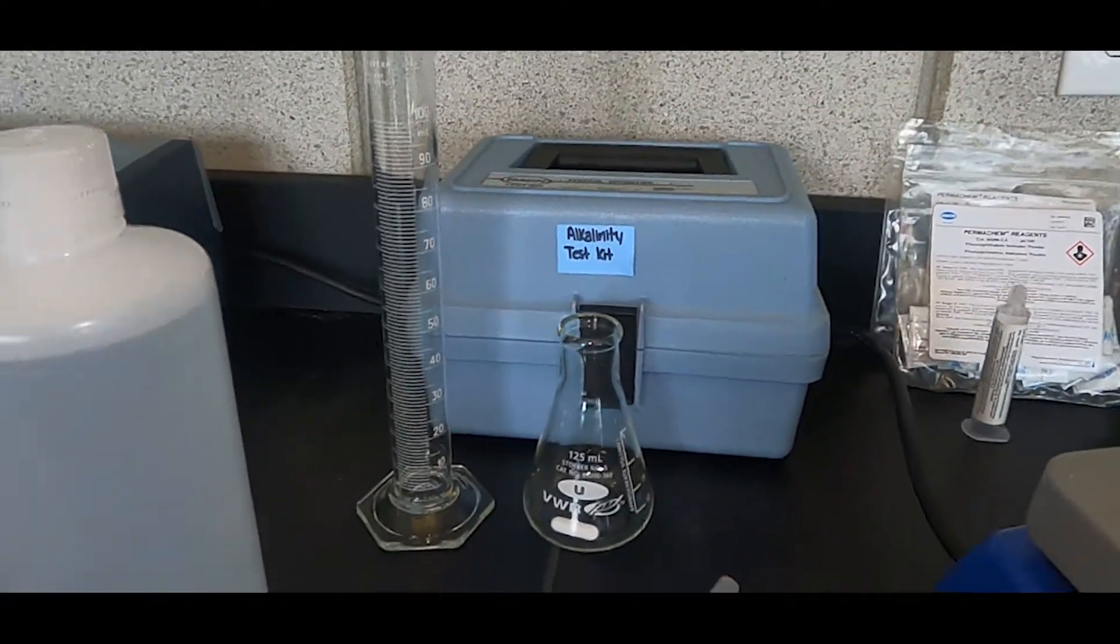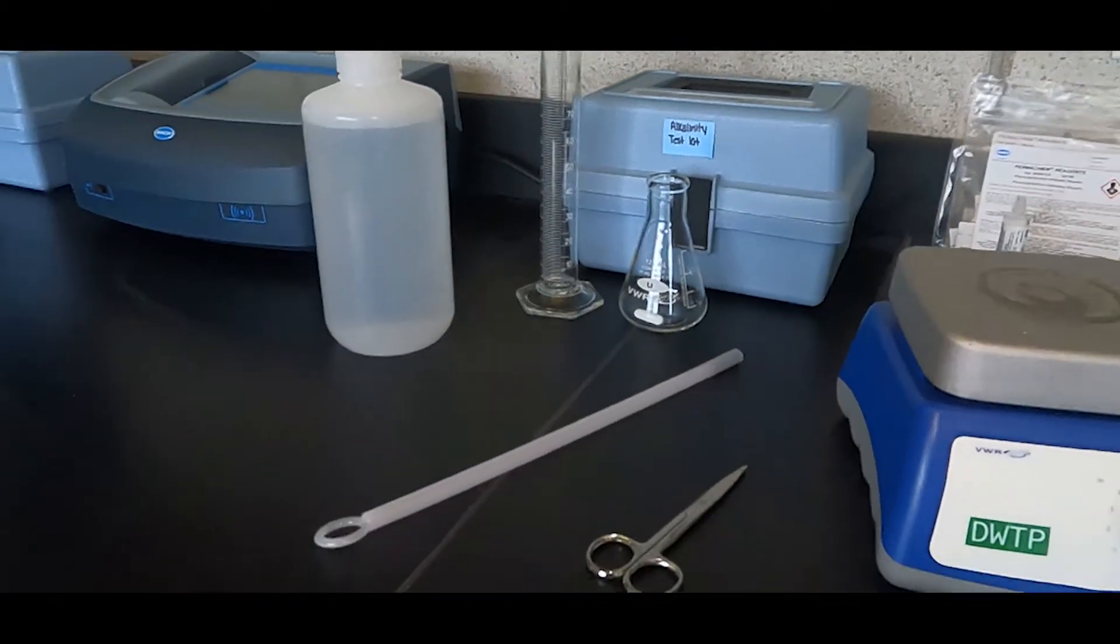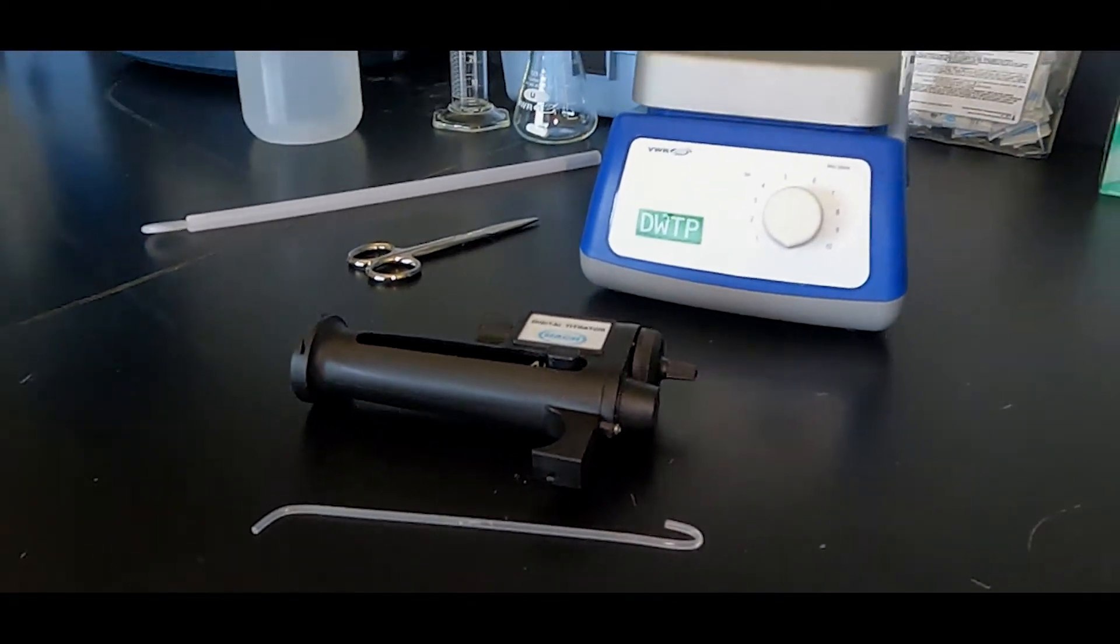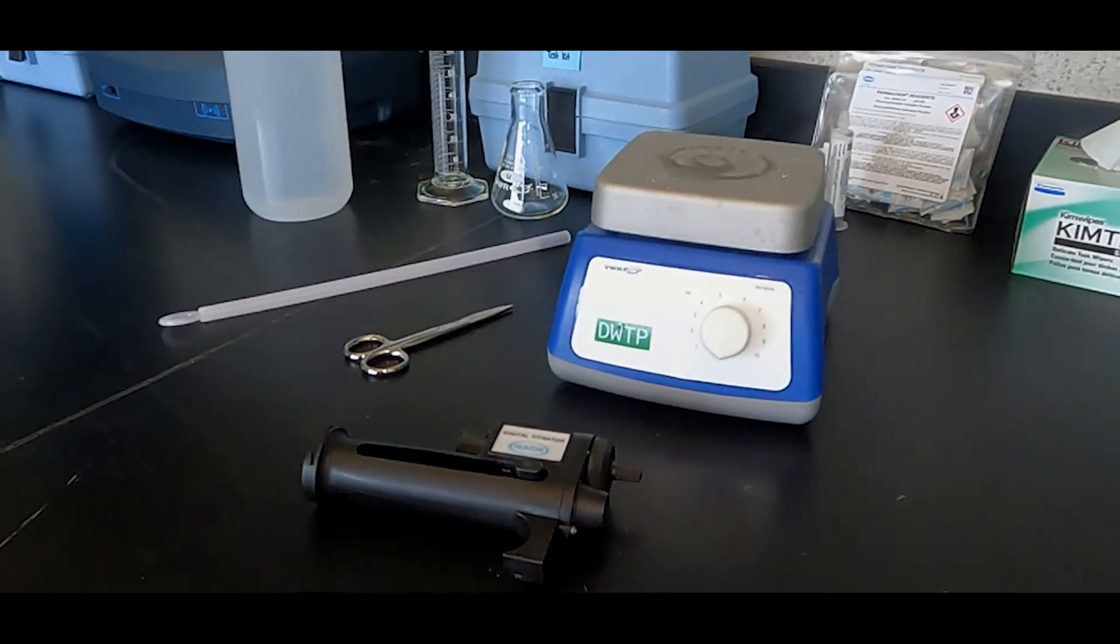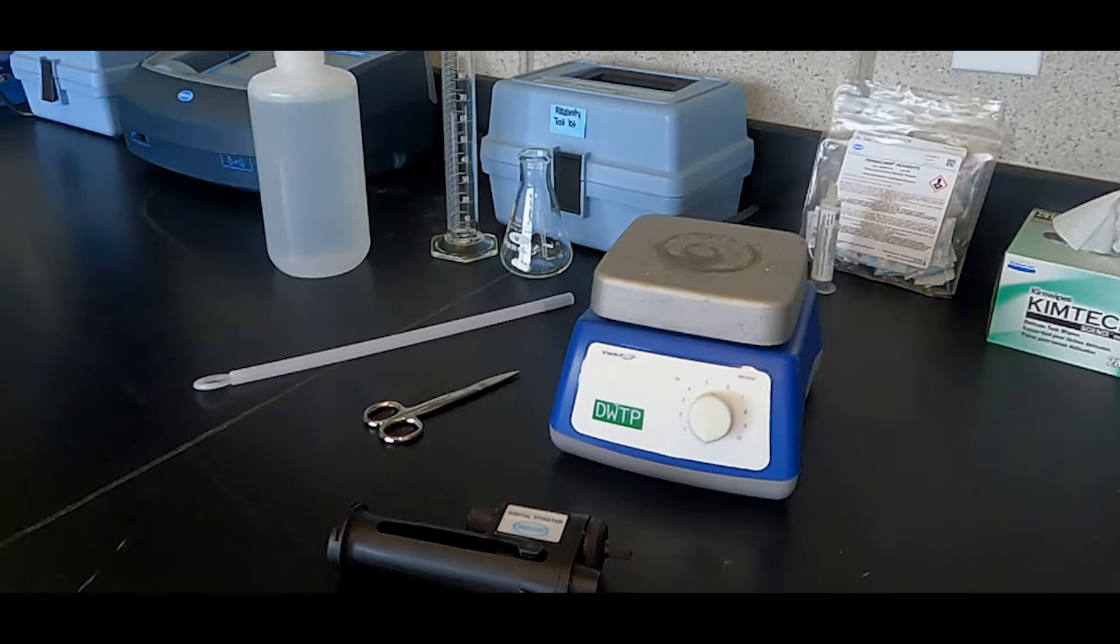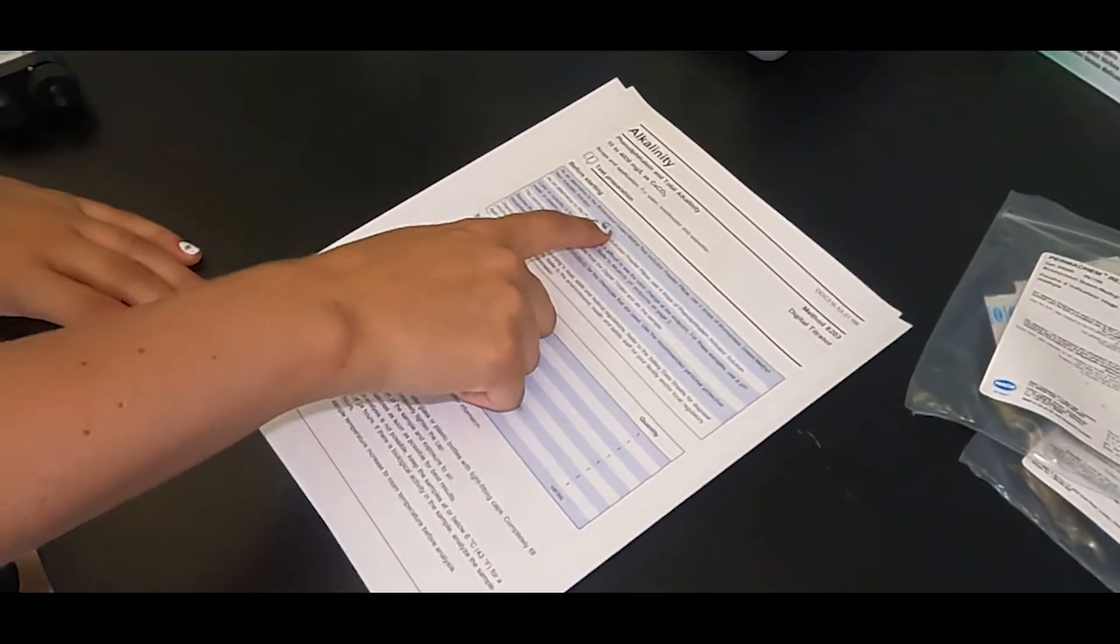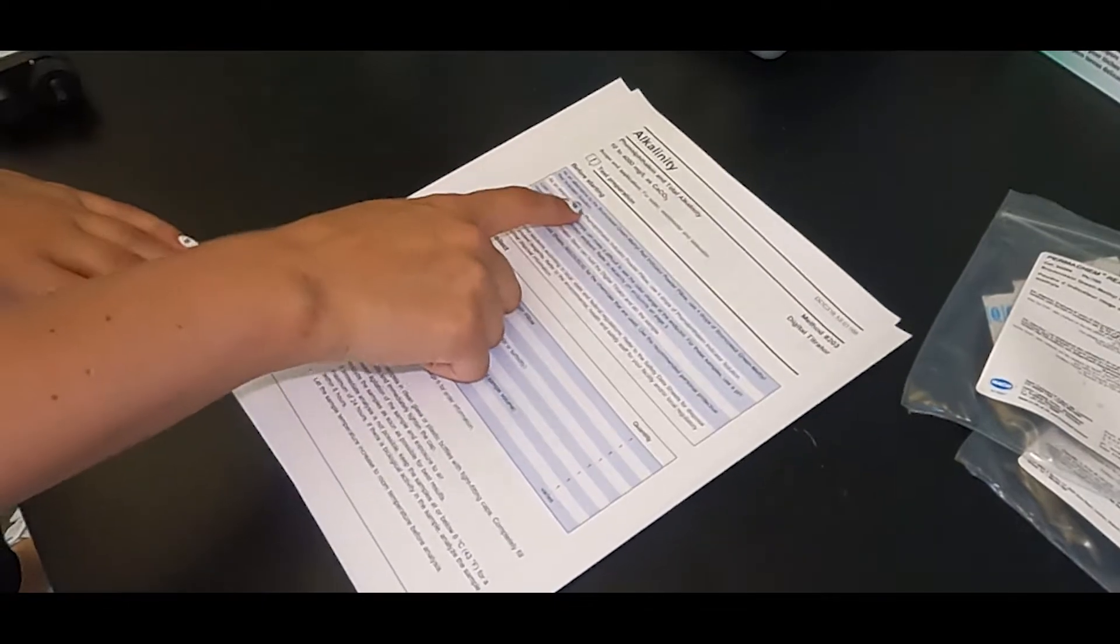Total alkalinity is a measure of all carbonate, bicarbonate, and hydroxide in the sample. This video will demonstrate how to properly analyze the phenolphthalein and total alkalinity of a water sample using a digital titrator following HAWC method 8203.